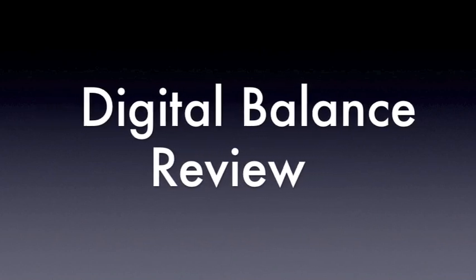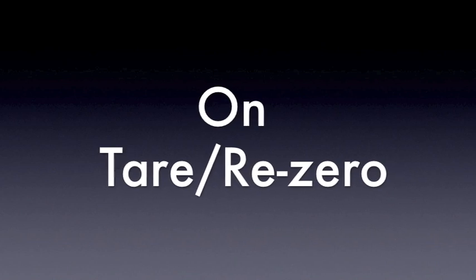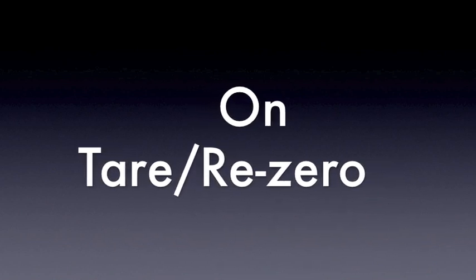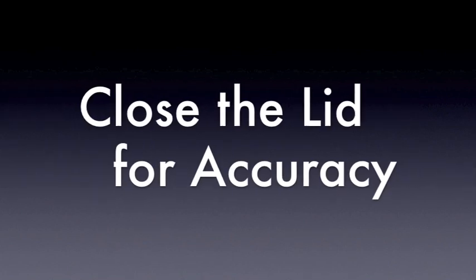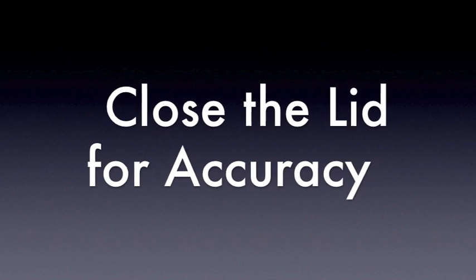Let's review. Remember that you must always set the mass of the weigh boat to zero. To do this, you must re-zero the balance by pressing the on button. Remember to close the lid to obtain the most accurate reading on the digital balance.